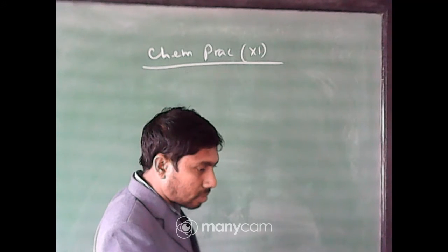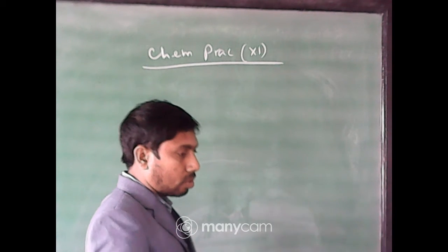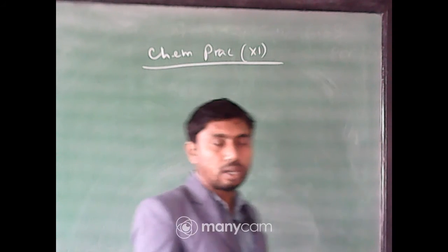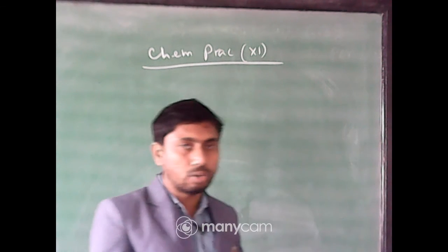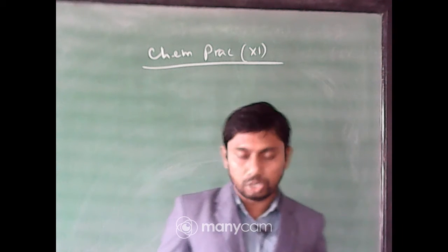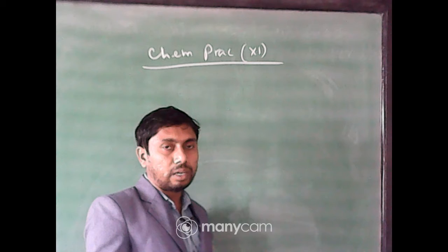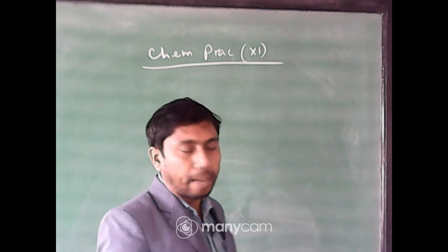Salt analysis. So, keep watching. At the same time, we will show you the experiments and also the theory involved in this. Now, what are the group reagents you have to know?